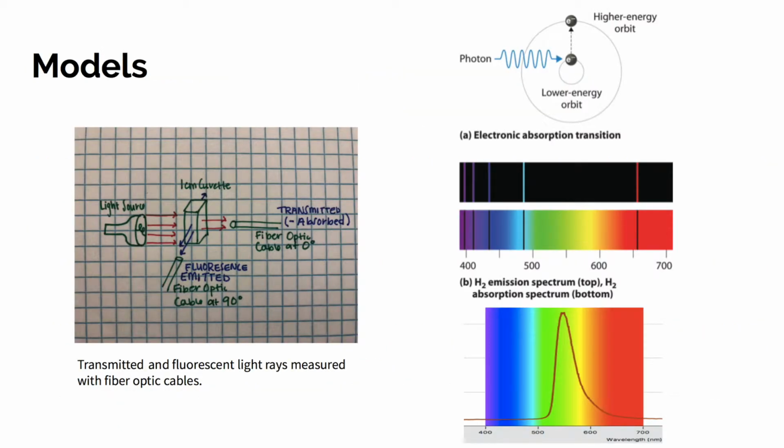On the left side of the slide, this is the setup that we used in class. On the top right, this was what was occurring on a molecular level, and on the bottom right, the spectra seen is similar to what we saw in the emission spectrum in class.